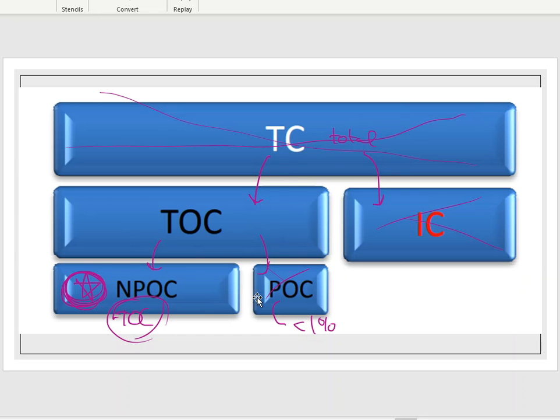So this is the breakdown, once again, of the different types of carbon that might be in my sample out there. But once more, the TOC analyzer actually does not measure both NPOC and POC. It measures NPOC only. That is just what we do. That's how we measure it. That's how it's always done, unless we're told otherwise. So this is assumed. My NPOC is what we are reporting on the TOC instrument.